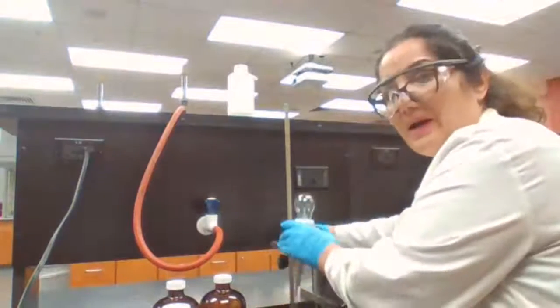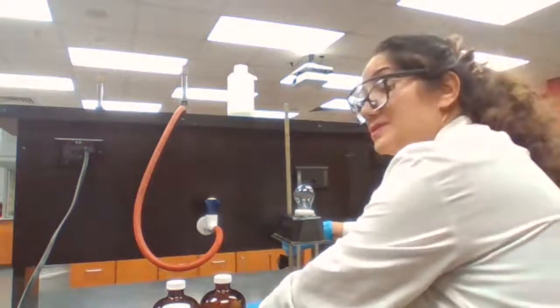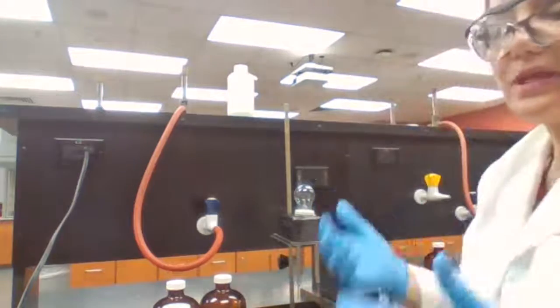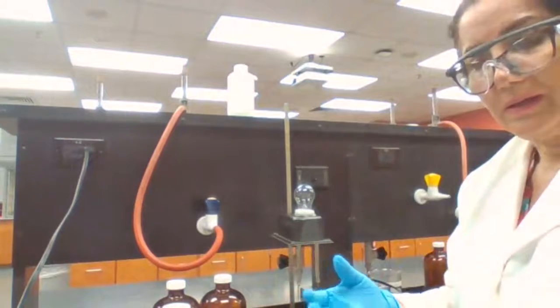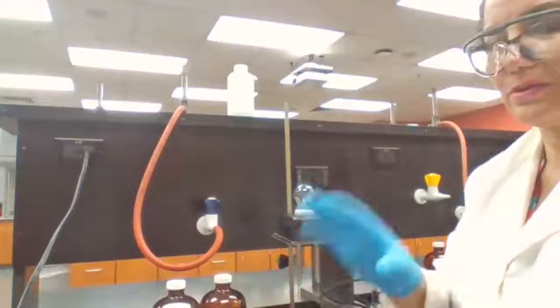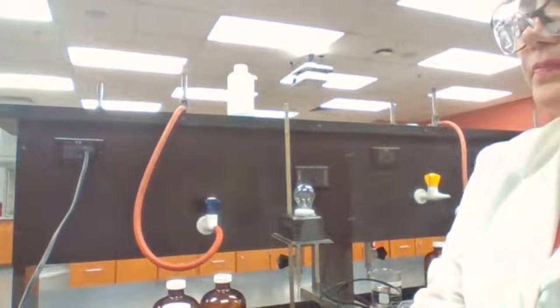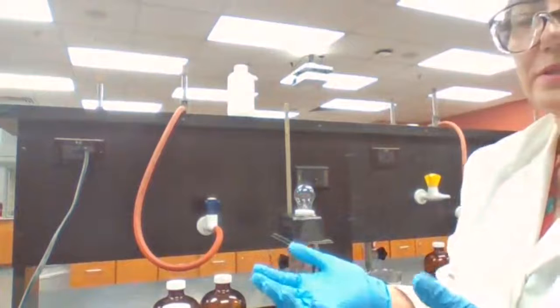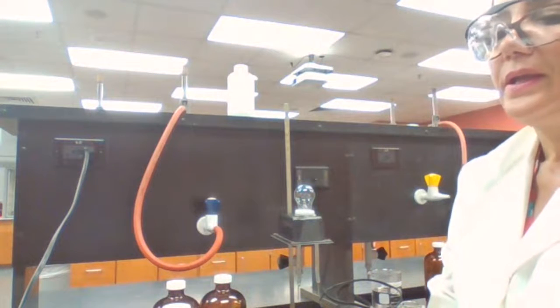If it gives me an ionic compound that is not soluble, that's a different story. That looks like you are placing those poles inside an insoluble compound like calcium carbonate, a solid compound. So there are no ions, because if it's not soluble, it's not going to generate ions.